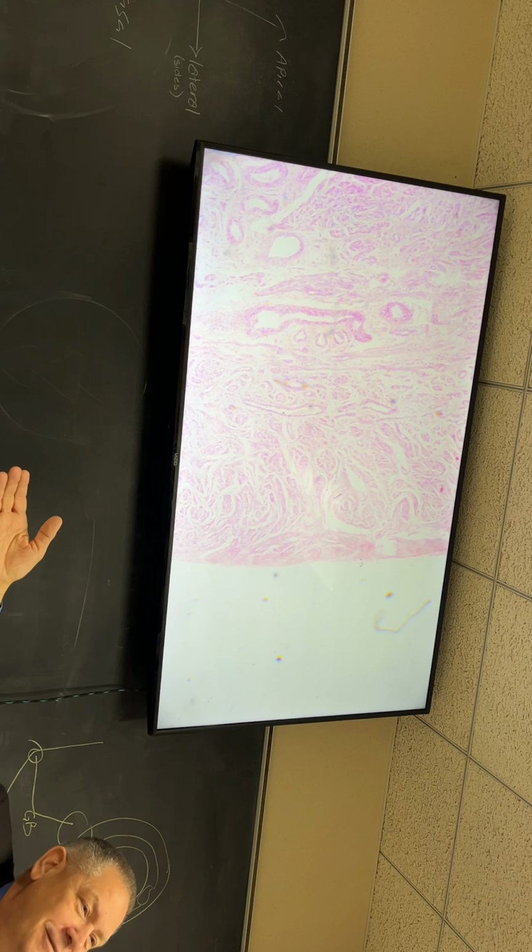Not very thick. And you saw how far I scanned across, right? So let me go scan across again. So myometrium starts about here, right? And I'll show you the rest of it. So myometrium, ready? There you go. There's the end of it. It goes a little ways, right? What kind of muscle again? Smooth muscle.